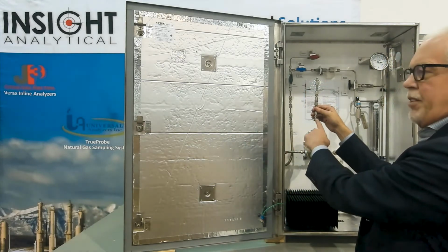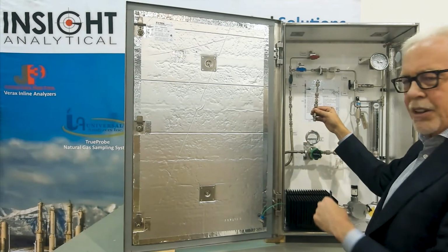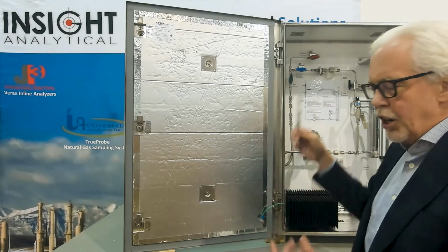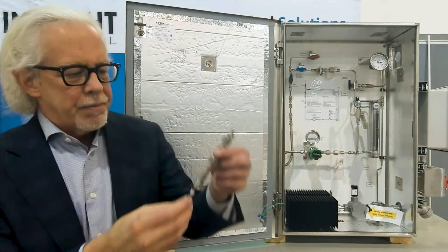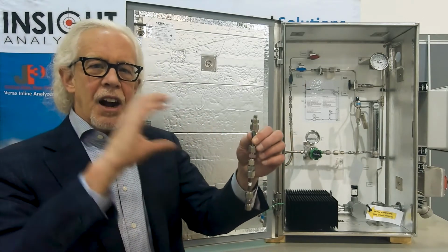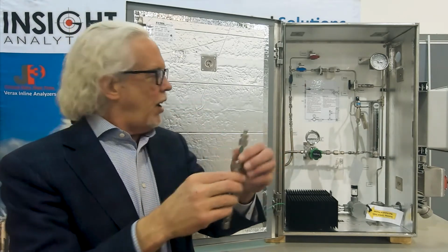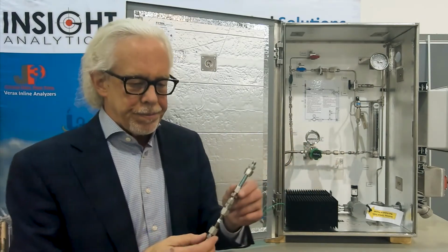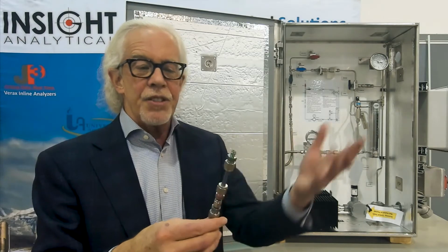We know the total volume that flowed through here, and we can figure out how many milligrams of dithiazine got absorbed on here. We can determine the concentration. So we bring this trap back to the lab, have it shipped in, we extract the dithiazine, and we make a measurement of how much dithiazine was on the trap and what was the total flow through the system. That gives us the dithiazine concentration in the pipeline. This allows us to make measurements on daily, weekly, or bi-weekly intervals where we can determine if the dithiazine concentrations are changing and if there's potentially going to be any problems upstream.